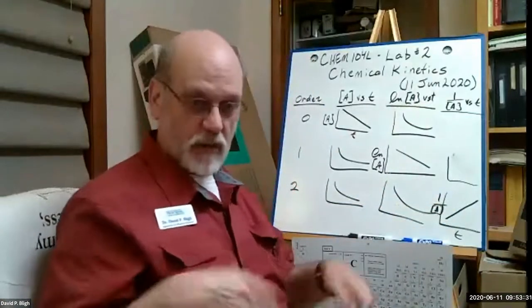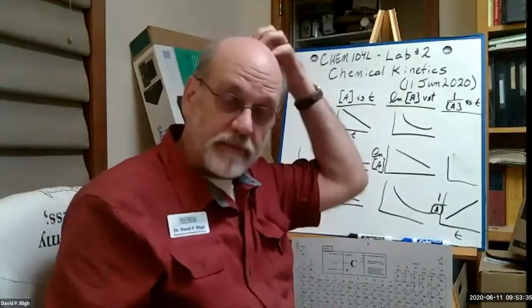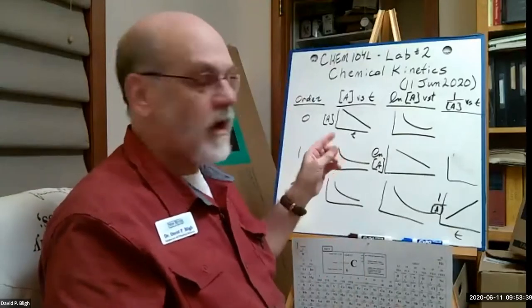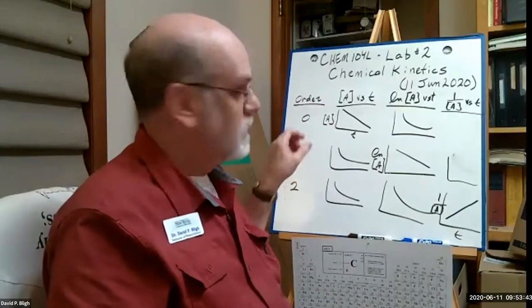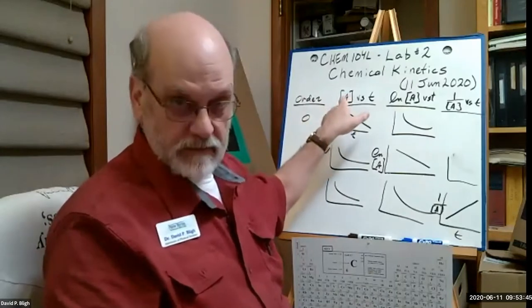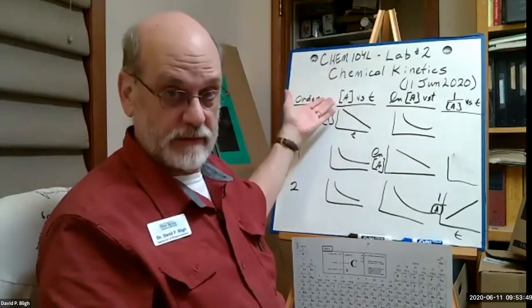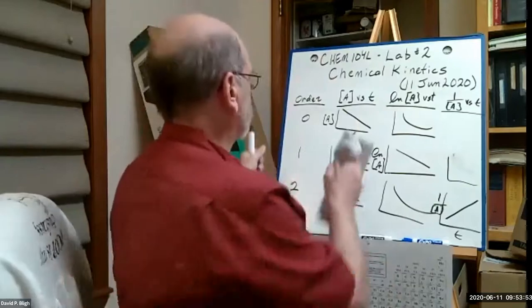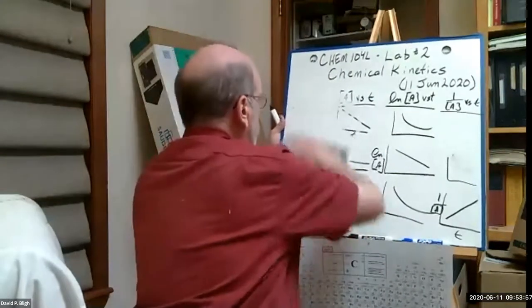Okay, so you recall from our discussion in class, that's how you determine if the rate law is 0, first, or second order for that reactant. And in this case, it's the blue dye, and we're using absorbance. Okay, so I think I can erase that now.